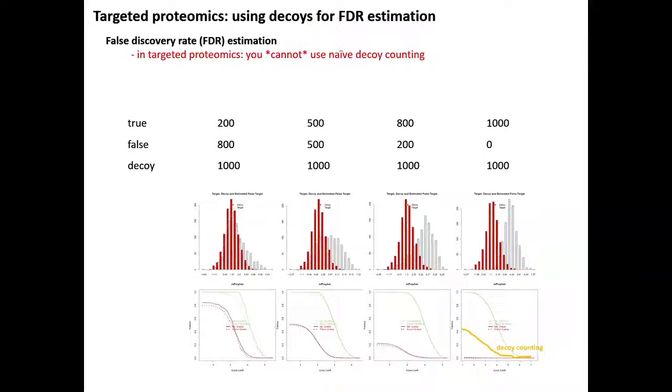So here, for example, at 1% decoy peptides counting, you would say, okay, I stop here, but here you only identify 70 or 80% of your peptides, and you will miss all these peptides here, which are of course low scoring, but that should still be present in your samples because you know that those are human peptides that should be present in your samples.